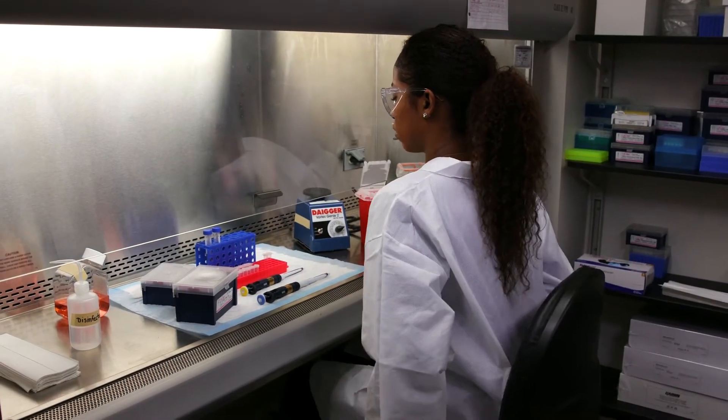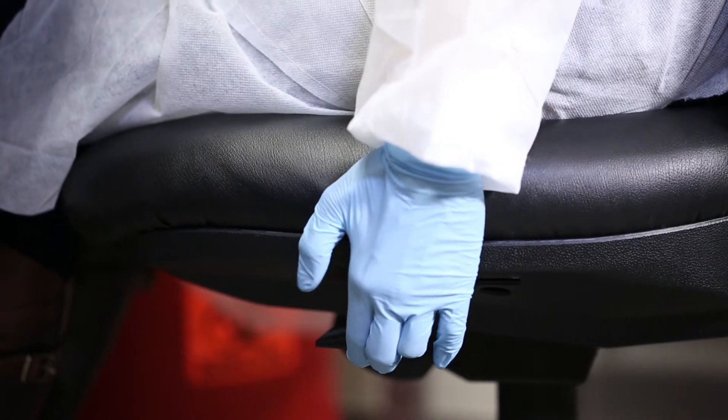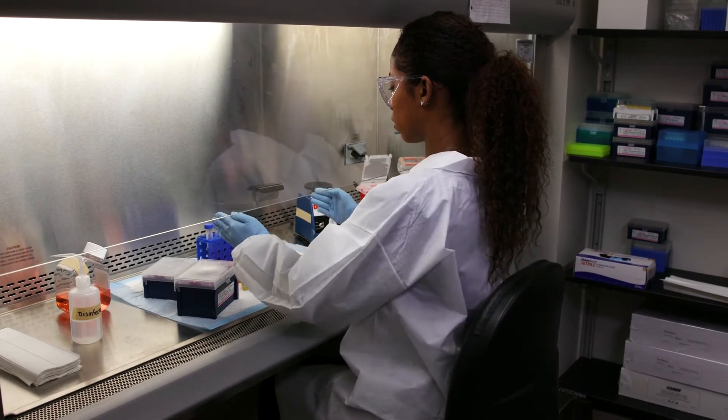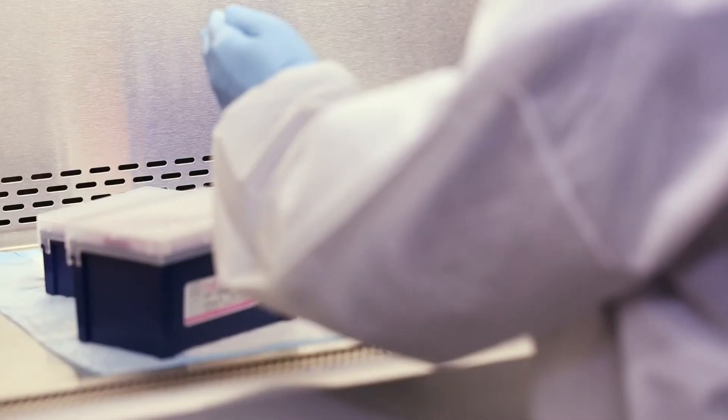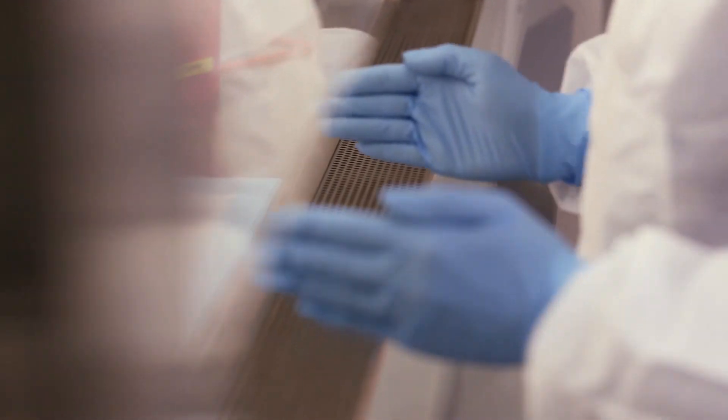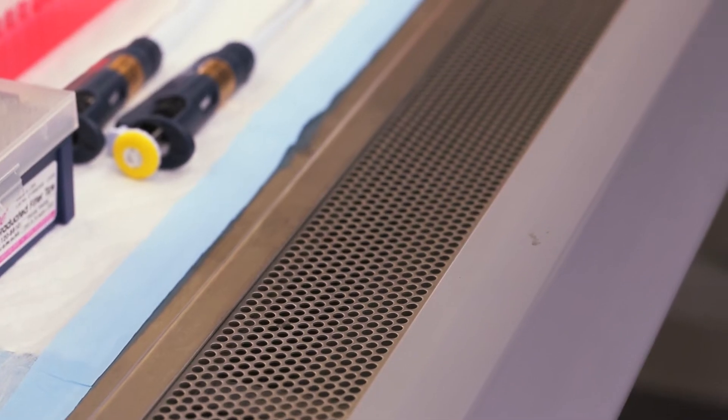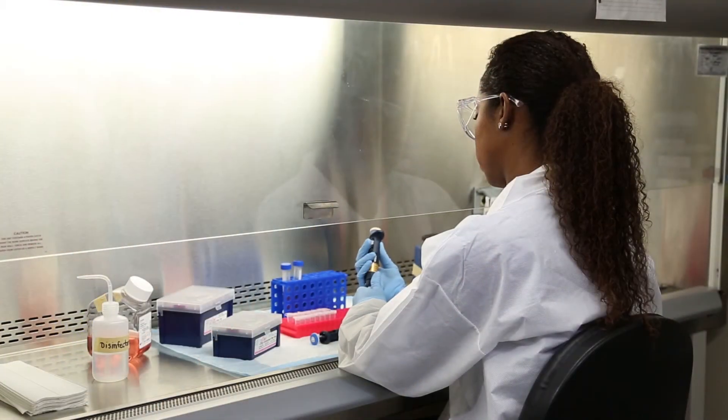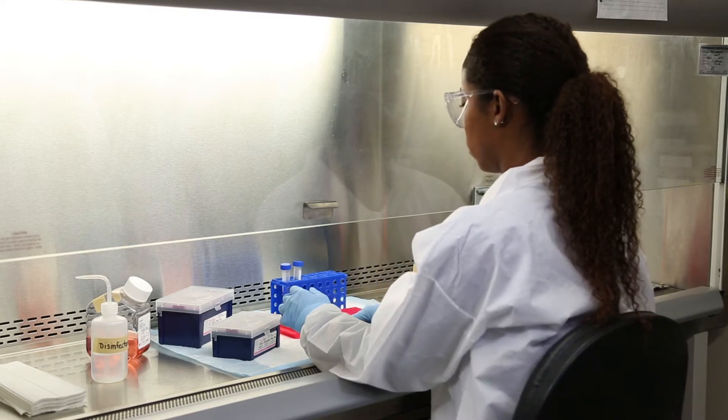Sit down at the BSC and adjust the height of the chair so your face is above the opening and behind the glass. Your arms should be bent at a 90-degree angle at the elbow while inside the BSC. Some BSCs are designed to allow your arms to rest on the front part of the BSC to avoid fatigue or ergonomic injuries over time.